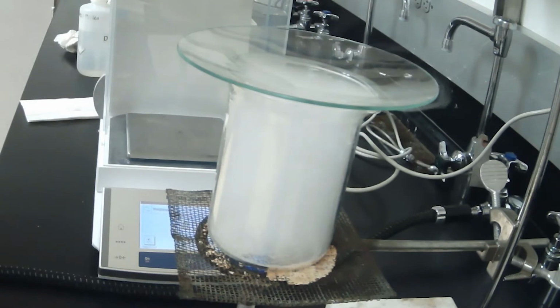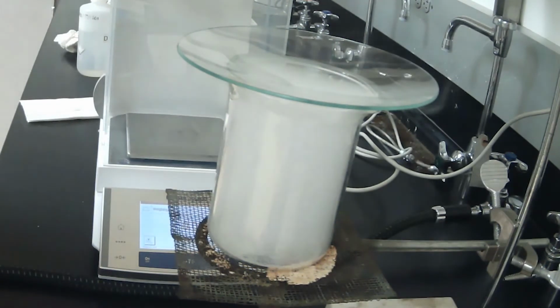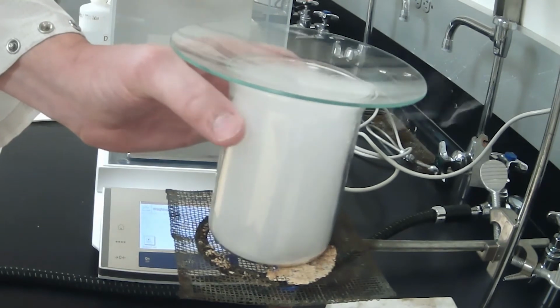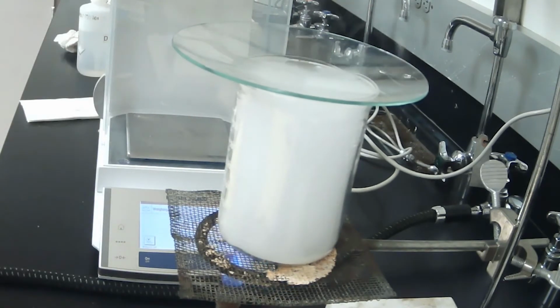We can see this, it's smoking pretty heavily. I'm going to bring the exhaust fan over just for a moment. Make sure we do not accidentally set off fire alarms again. No laughing. I'm actually going to turn this spout over towards the side.